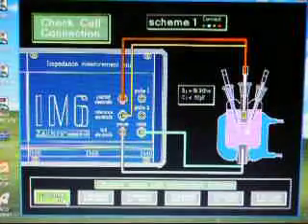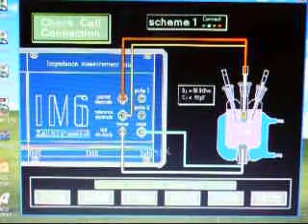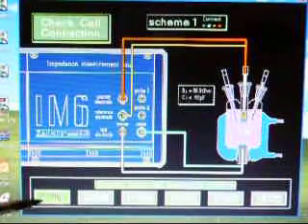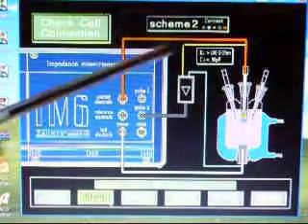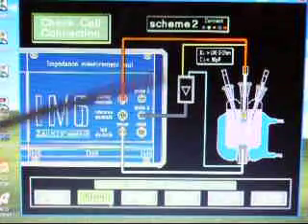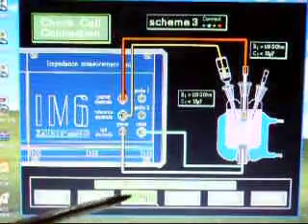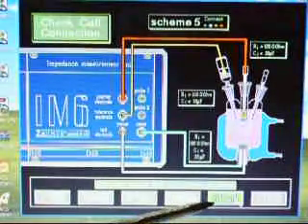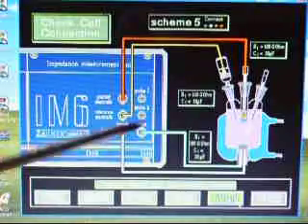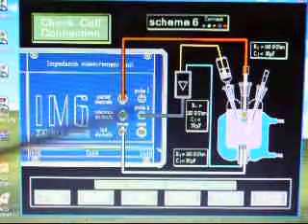We can click 'check cell connections' and that will give us a schema showing how the input should be arranged: two electrode with no buffer, two electrode with buffer — where the buffer is an external piece of hardware that allows you to condition the signal — three electrode no buffer, three electrode with buffer, four electrode no buffer, where you can see the working and sense, reference and counter, and four electrode with the buffer amp using the Pro-V inputs.